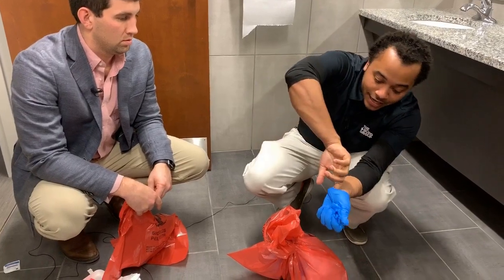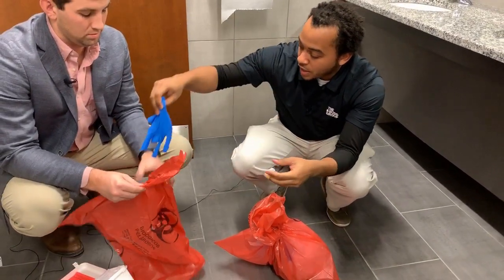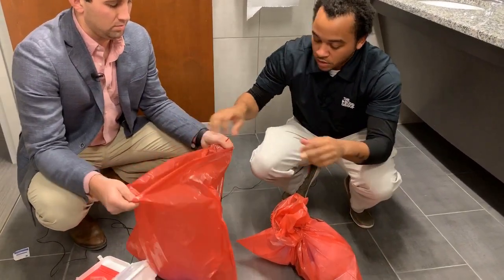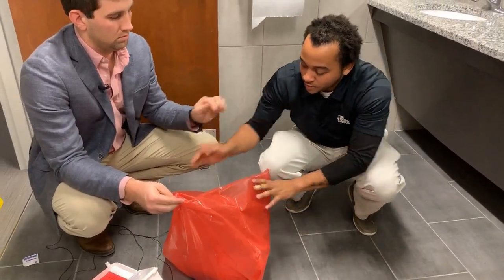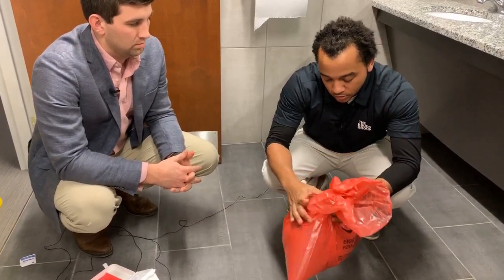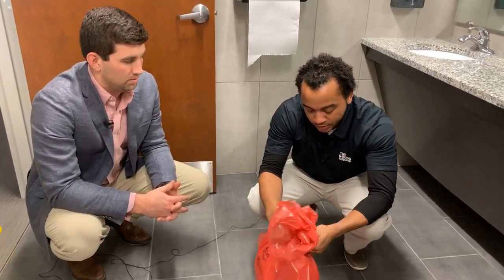And then you take the other glove off inside out, over top of the glove that was in the hand, and you dispose of it into the red bag. And then you take the contents here, place it in the red biohazard bag, and in the last zip tie, being as such.